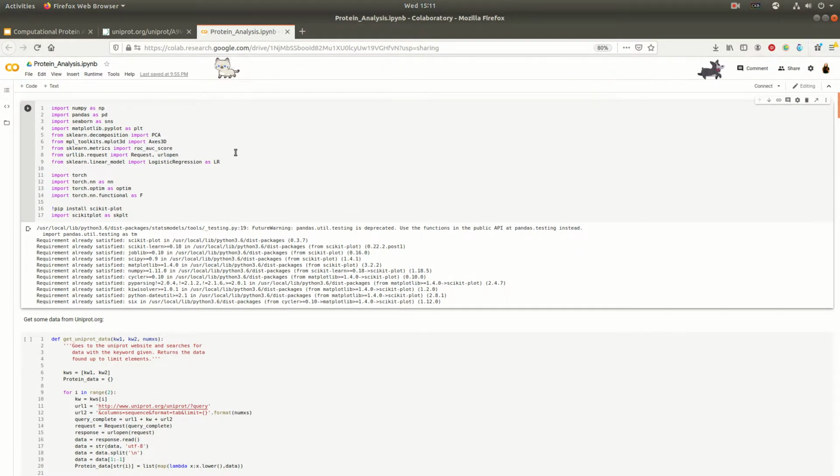And first thing we're going to do, again, don't get scared by all the code. We're not trying to understand each line of code. We're just trying to understand the general process of how you would do a project from start to finish. And we're going to leave out a lot of details, but the goal is to get the basic overview down.